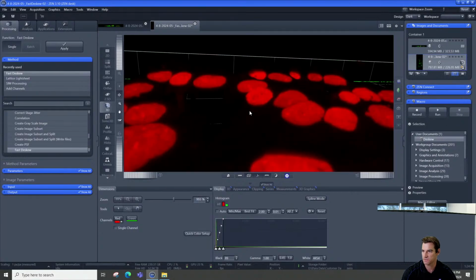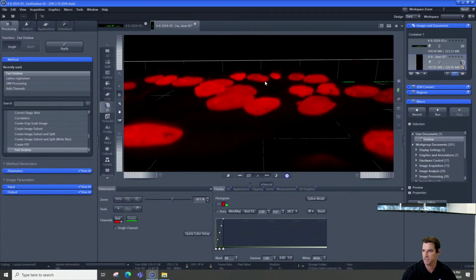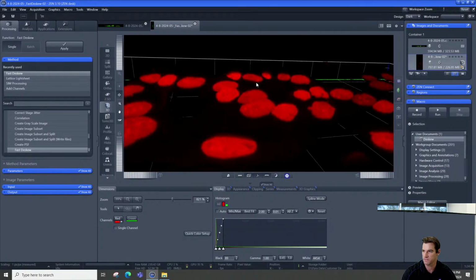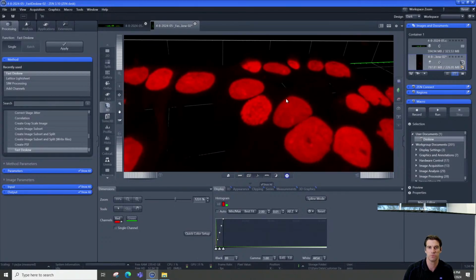And what's also unique about this is that you may be able to tell that I'm looking at this from the side and not really using too much caution doing that. If you were to do this with an inverted microscope, because you're illuminating and collecting with that single objective, you actually have an extended point spread function. And the practical ramification of that is that you will get a really smeared z-axis. And so you can't turn your samples on their side.